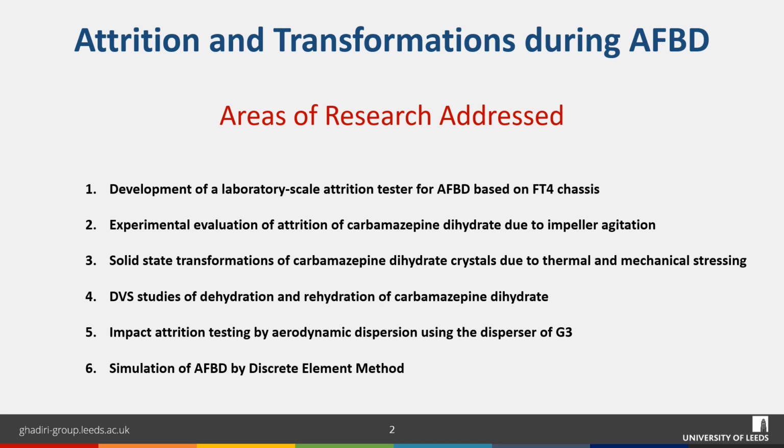My talk will be focusing on the first two items here. I'll first go through the development of a lab-scale attrition tester for agitated filter bed drying that is built on top of a FT4 rheometer. Following that, I will then show you a case study looking at evaluating the breakage of a pharmaceutical ingredient, carbamazepine dihydrate, using the rig that we developed.